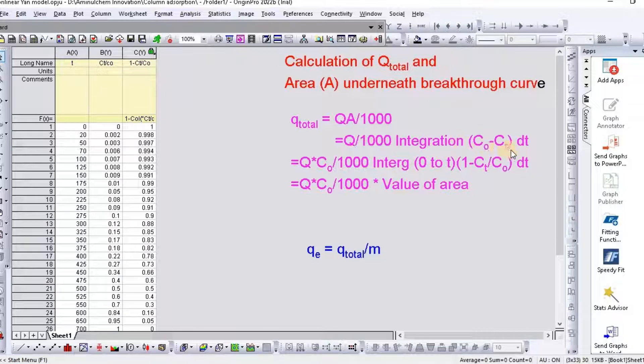C0 minus Ct dt equal to Q C0 divided by 1000 integration 0 to T, 1 minus Ct divided by C0 dt.